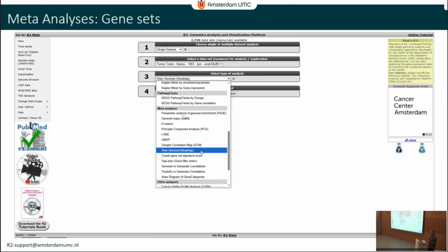Is there a way to check if your assumptions hold with all these tests? Not for the Cox proportional hazards. We haven't implemented that. It is something that can of course be implemented, because all of these analyses are actually run in the back in R sessions. So we can just extract these features out of it and make that a column that can be used in conjunction.